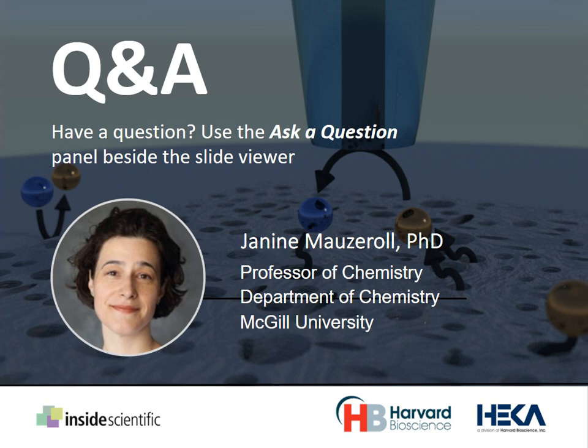Well, the key in substrate generation tip collection mode is to choose your redox reporter molecule really carefully, and make sure that they're not in the same potential regime where they could contribute current.